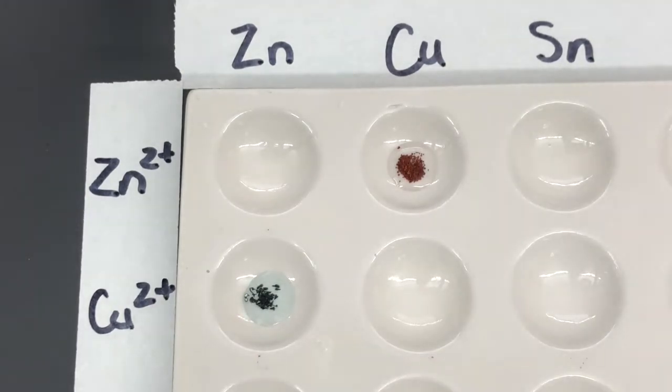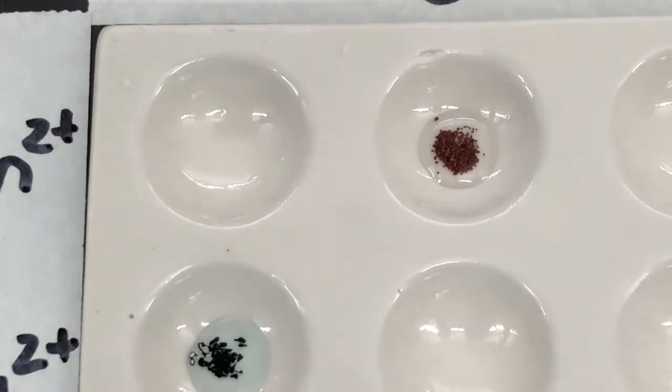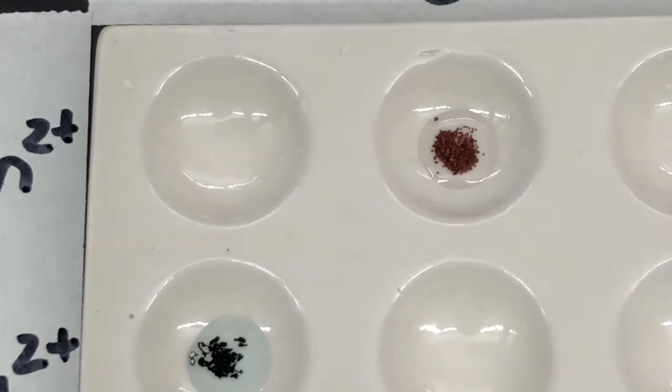So if you're watching closely, what you'll notice is we started with zinc that was a nice silvery zinc color, and almost immediately in solution you start to see the zinc metal being coated with this dark coating. The dark coating is the copper 2+ that is reacting and forming copper solid on the zinc particle.